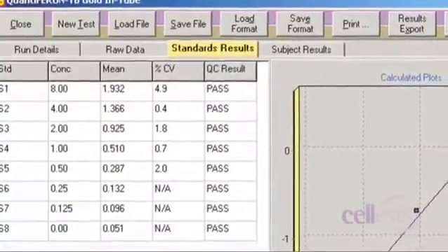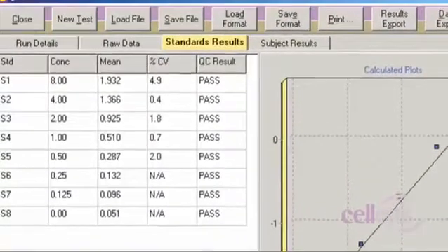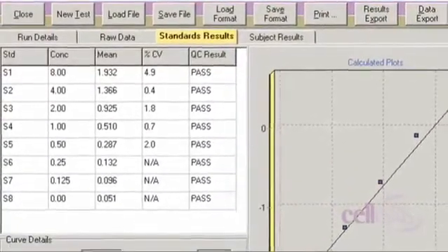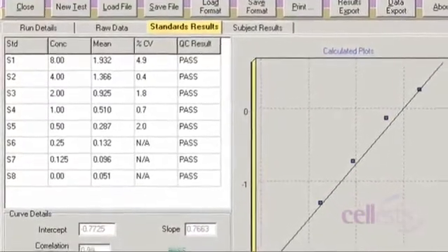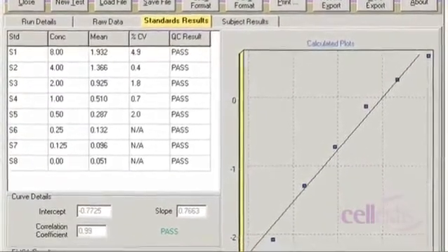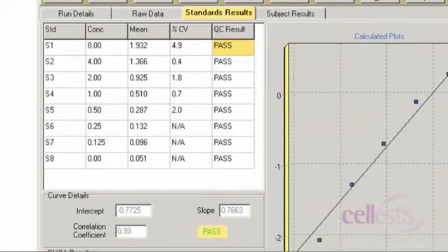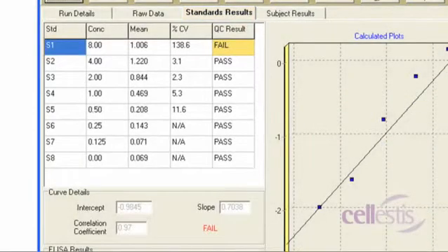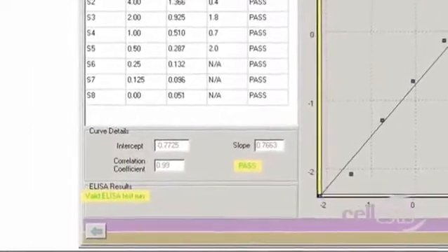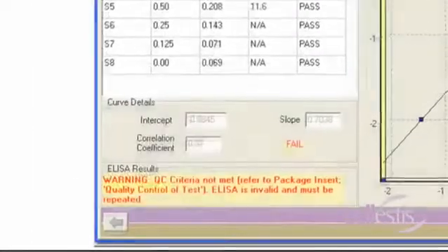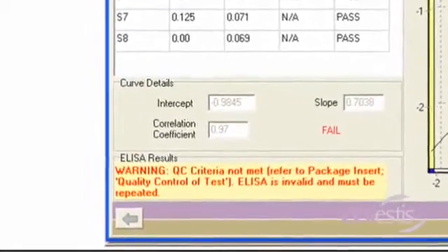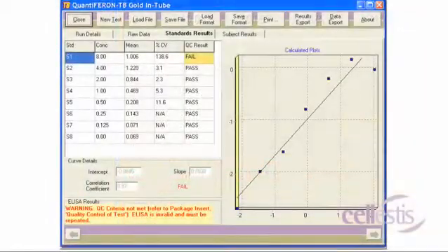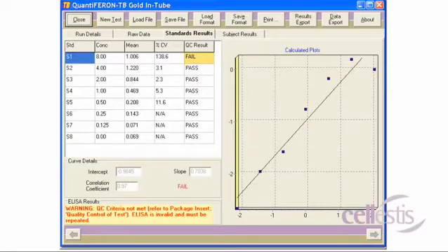The Standards Results tab displays this standard curve and provides information directly related to the acceptance criteria of the ELISA. The results of the quality control acceptance criteria are shown as Pass or Fail. A statement indicating whether the ELISA test run is valid or invalid is shown at the bottom of the screen. If any of the quality control criteria are not met, the ELISA test is invalid and must be repeated.